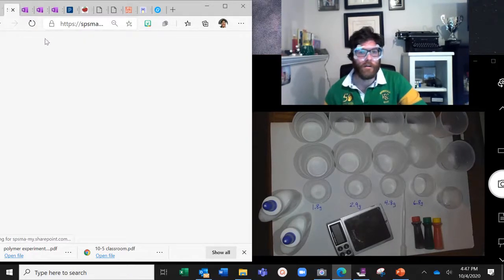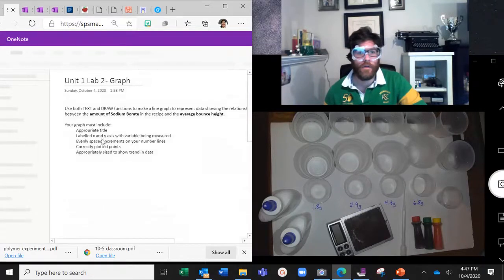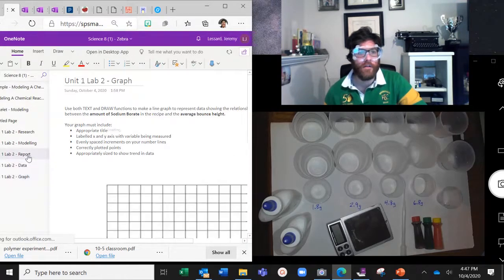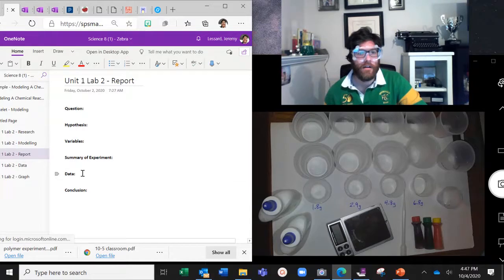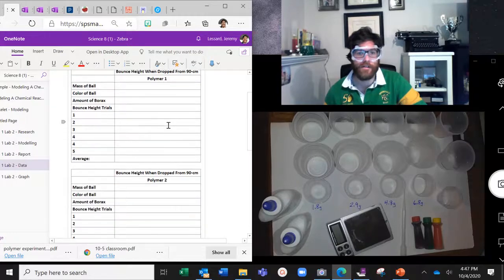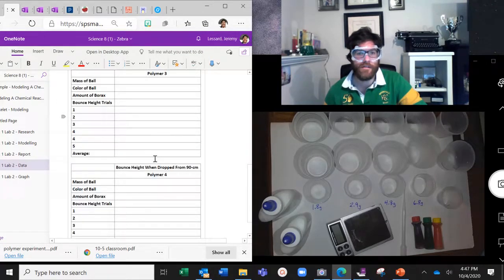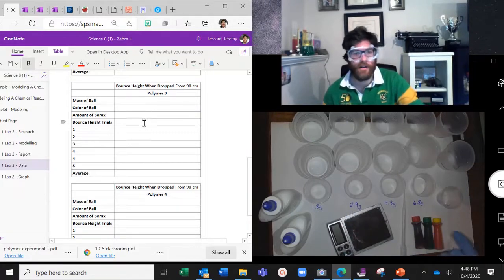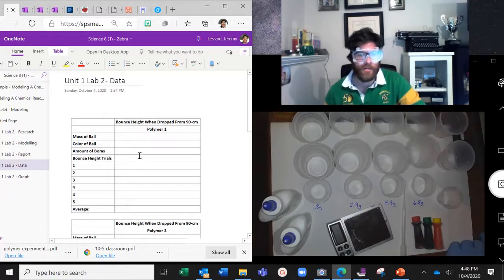We should be recording our data in our OneNote notebook. Okay, we're eventually going to be making a graph, but you will be recording your data not here under Unit 1 Lab 2 report. You're just going to write C data, right, under this tab here. And you're going to find all these data tables for our 4 polymers. You'll fill in the mass of the ball, which I will tell us the color, the amount of borax that's written here, and then we'll eventually get to our bounce heights, okay? So that's where we're at. We'll check in with you later on.